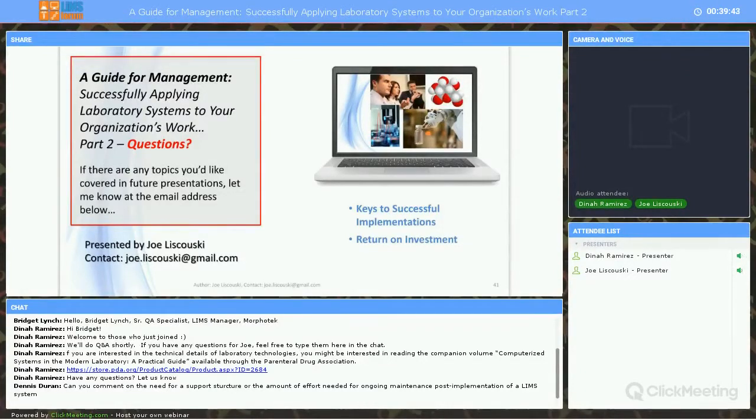The IT people are going to be concerned with whether or not the computer systems are working and the operating systems. They may not be able to get involved very well with the actual LIMS application itself. So as things change, as testing is added, these things need to be done very carefully. They need to be documented so that they meet all validation requirements, and that somebody doesn't make a change that messes something else up.